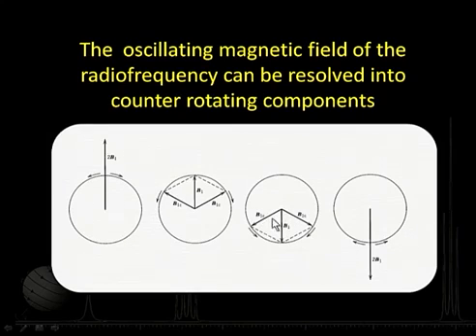When they become like this, the net is like this, and then when the two align again in this direction, we find it becomes so much. Essentially, if I look only at the resultant vector, it is very large here, becomes smaller, becomes 0 here, then it becomes negative like this, and then further like this.